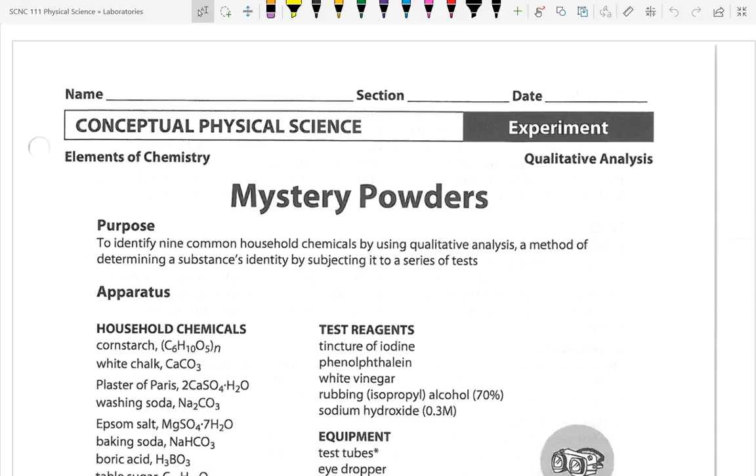Our lab today is going to be a very standard chemistry type of lab. This is the first experience you're going to have using some substances that could be a little toxic, like sodium hydroxide, NaOH. That's pretty much following the naming schemes that we've learned.